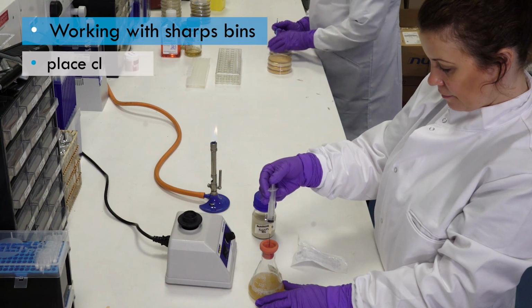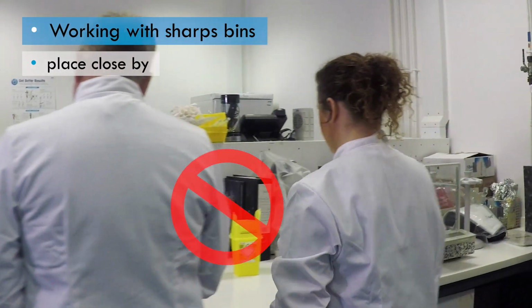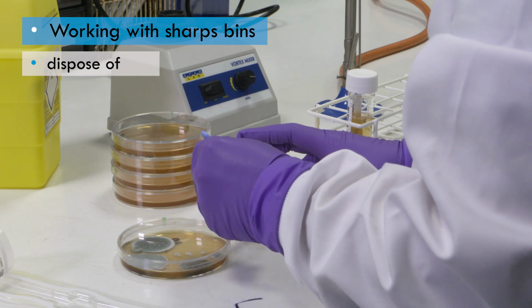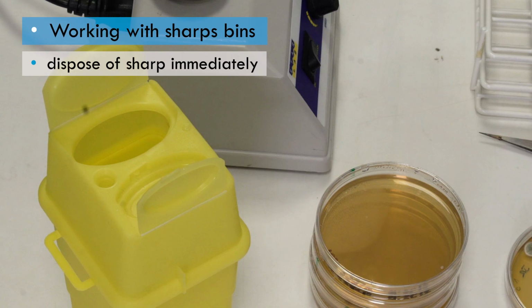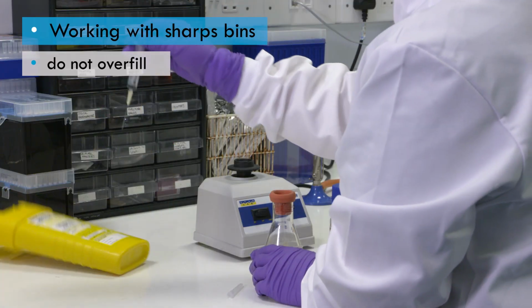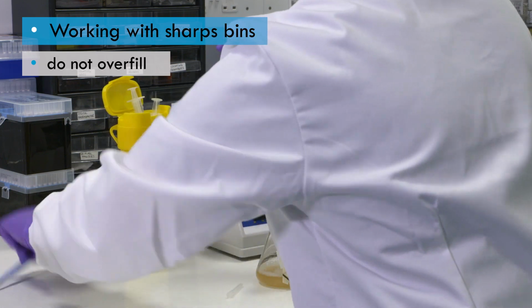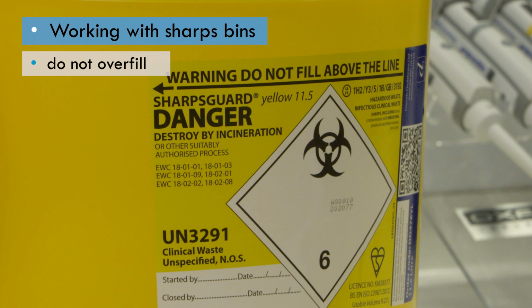Sharps bins should be placed as close to the work as possible to avoid moving around the laboratory while holding sharps. The sharps should be placed in the bin immediately after use. These bins must not be overfilled, as this can create an additional sharps hazard. Many commercial sharps bins have a maximum fill level marked on the outside of the container.